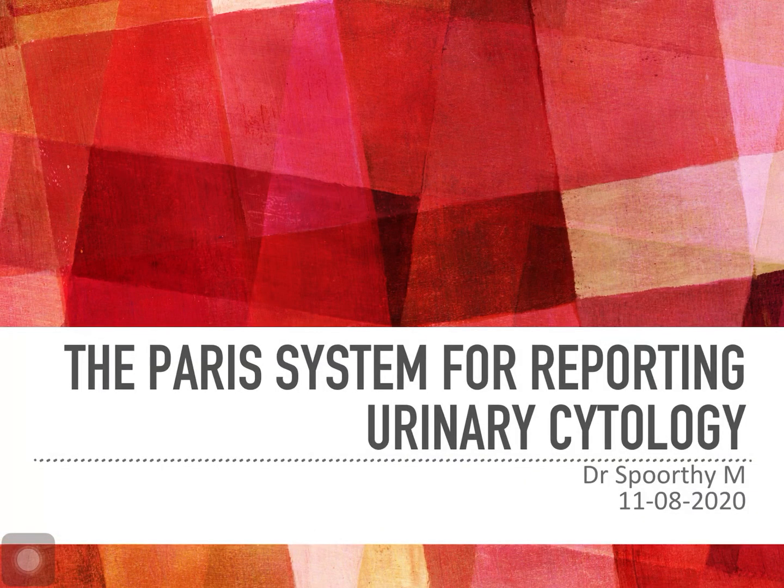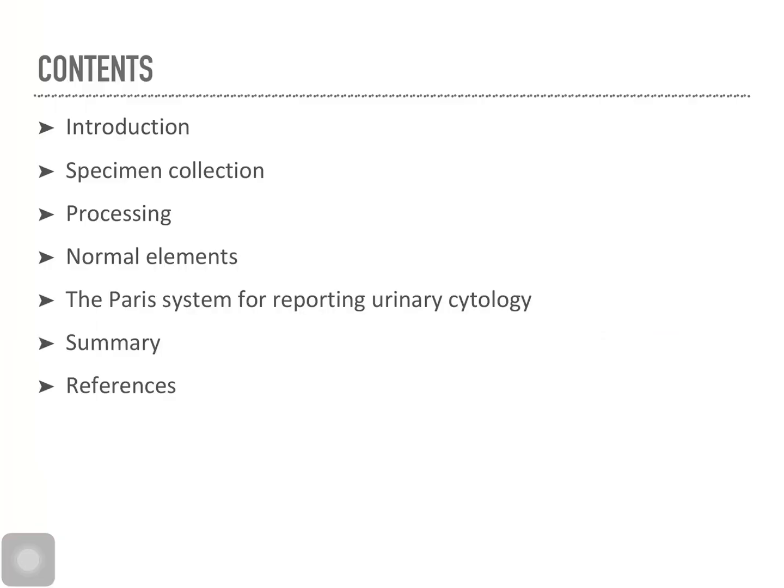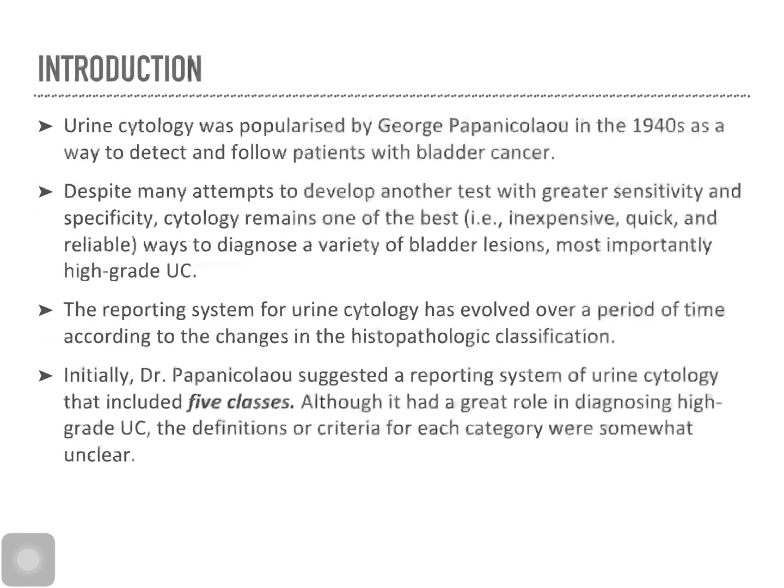Good morning, everybody. Today I'm going to present my seminar on the topic The Paris System for Reporting Urinary Cytology. I'll be dealing with the following headings: Introduction, Specimen Collection, Processing, Normal Elements seen in urine cytology, the Paris System for Reporting, Summary, and References.